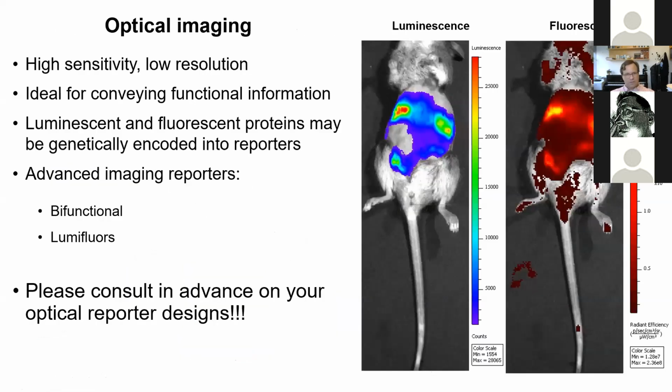Starting with the first technology, optical imaging. I think this is probably the most familiar form of small animal imaging technology to most cancer biologists. The idea here is that you are looking at a light source that is either generated locally through a chemical reaction, such as chemiluminescence, or a light source that results from fluorescence from incoming stimulation of light at a different wavelength.